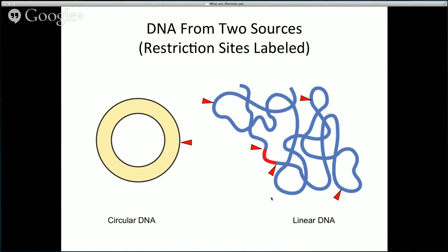But what you may not understand, and I'm not sure if the other TA went over this, is how did that gene get put into another gene and then get put into the bacteria? So I'm going to break it down step by step the best I can. Please ask any questions if you get lost, or wait until next week when I will be in class and we can go over it again.